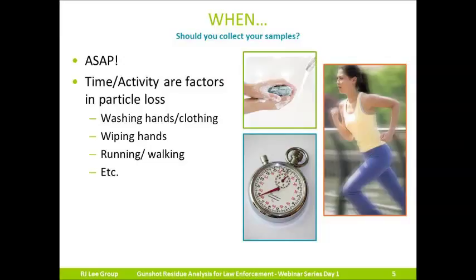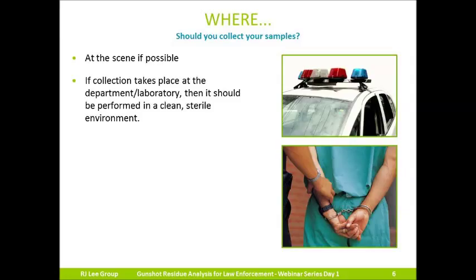It's cases like that where you want to look into taking samples from a subject's clothing or any other items worn during the time of the suspected shooting. Now I'm going to go over the where. So where should you actually collect the samples?